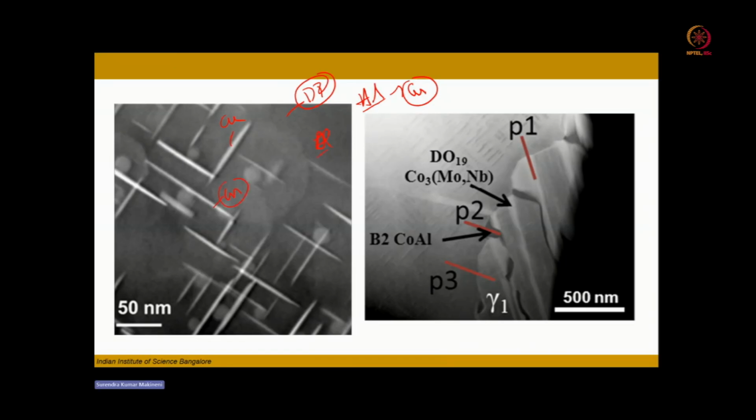As the beam strikes these copper rich plates, because of the higher atomic number, it will scatter at a higher angle. So you will get more signal in the high angle dark field detector, and so a higher intensity. The intensity here scales up with your atomic number. That's why you can see the contrast between the two regions, aluminum and copper rich regions.